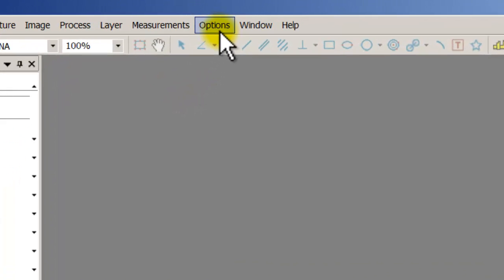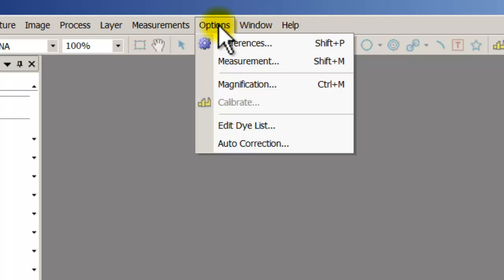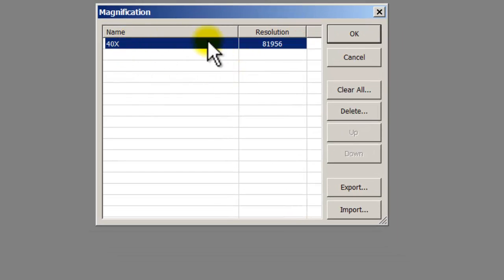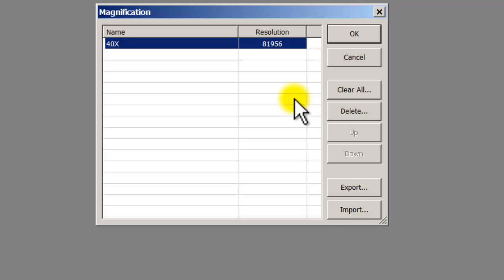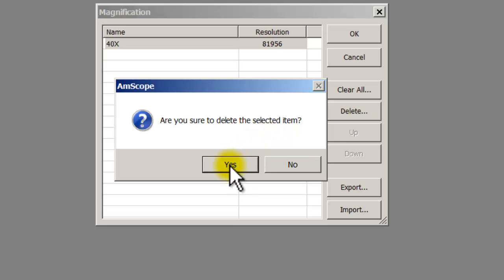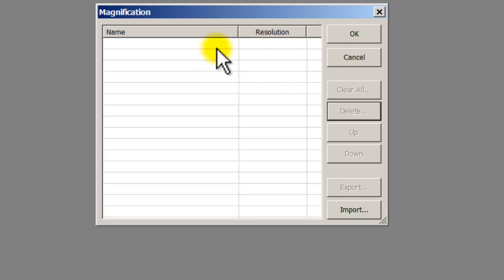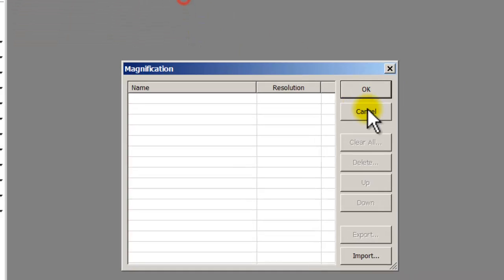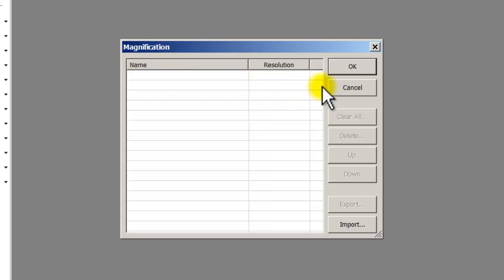First things first, go to the menu bar where it says Options and go to Magnification. You can see I already made a calibration, but since I'm going to start from scratch — or if you made the wrong magnification or wrong calibration — go ahead and click Delete. It will ask if you're sure; click Yes. Don't click Cancel or it will bring it back. Make sure after you click Delete you click OK. I'll double-check: Options, Magnification — and the past calibration is gone.